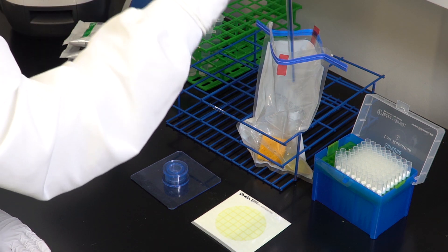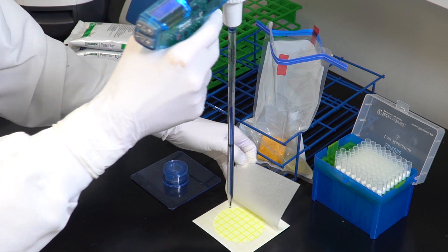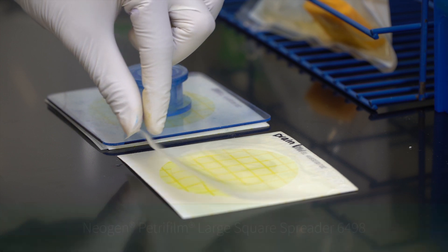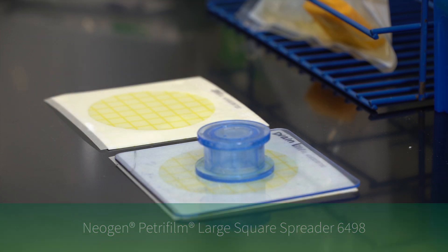To inoculate, lift the top film and dispense three milliliters of the prepared sample onto the center of the bottom film. Roll down the top film and place the Neogen Petrifilm large square spreader over the sample. Press gently to distribute the sample evenly.